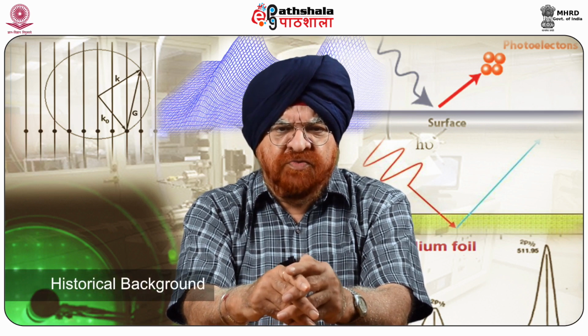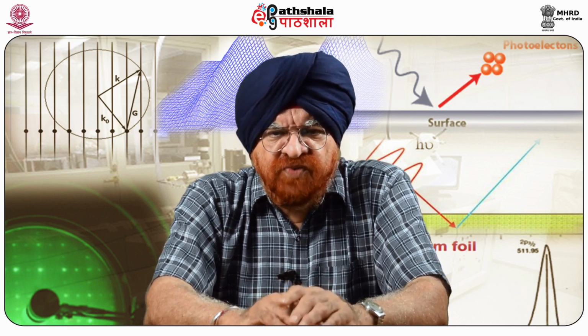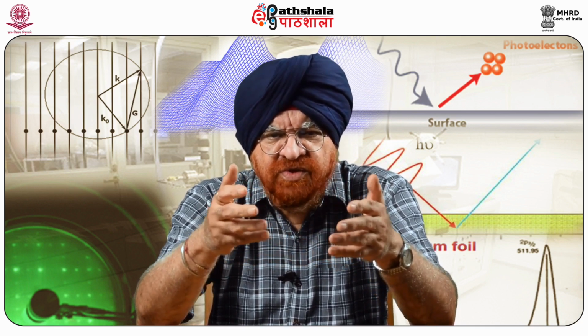Now I'm sure one is very keen to learn about the historical background of this equipment. CFM was primarily developed by Charles Lieber at Harvard University way back in 1994. The method was demonstrated using hydrophobicity, where polar molecules, for example COOH, an acidic group, tend to have the strongest binding to each other, followed by non-polar, for example an ethane CH3 molecule bonding, and a combination of the two being the weakest one can get.